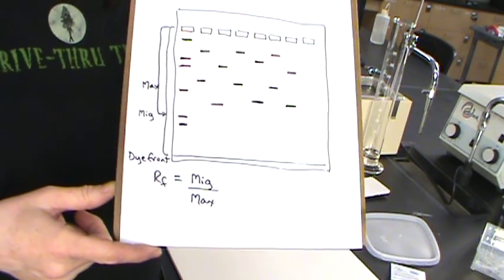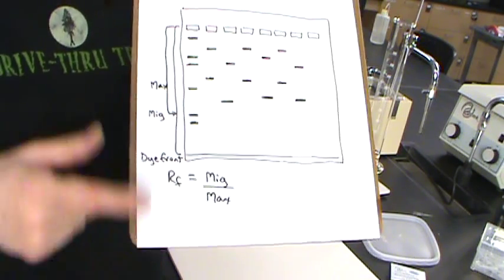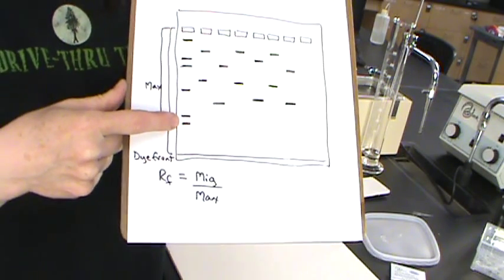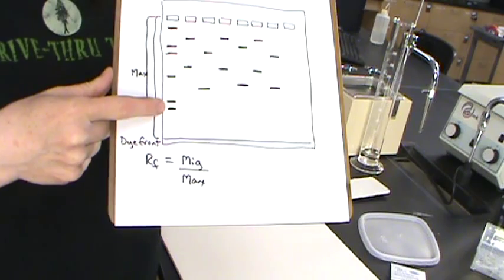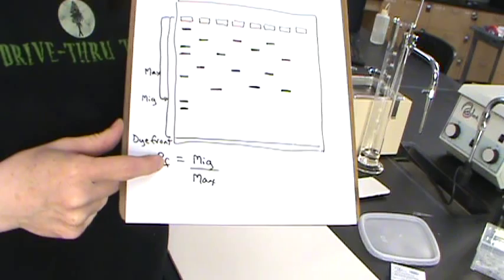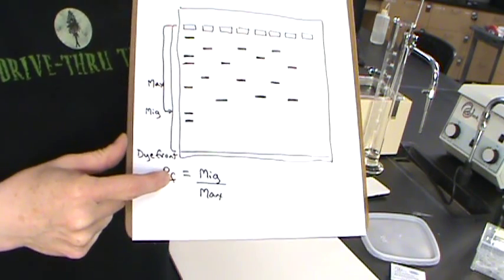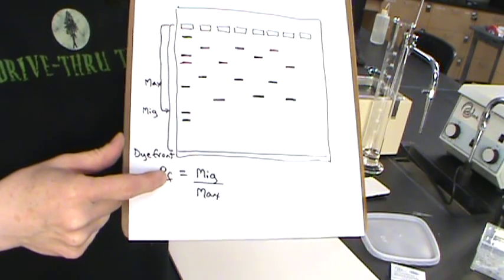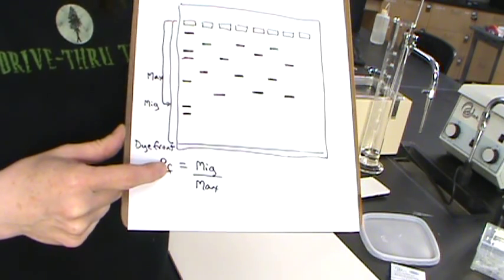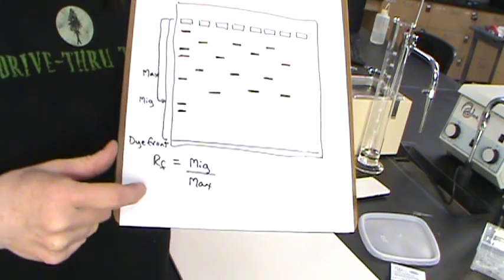Then you'll be doing some work where you will be plotting the sizes of the DNA fragments for these size standards versus the relative mobilities for each of them, the RFs, and see which graph, whether it's number of base pairs versus RF or log of base pairs versus RF, gives you the best situation for being able to predict the sizes of some of these other bands.